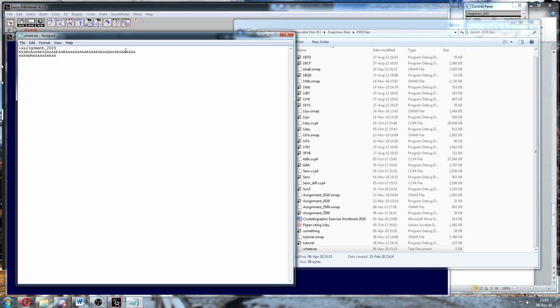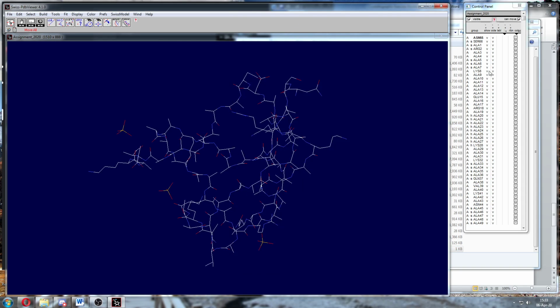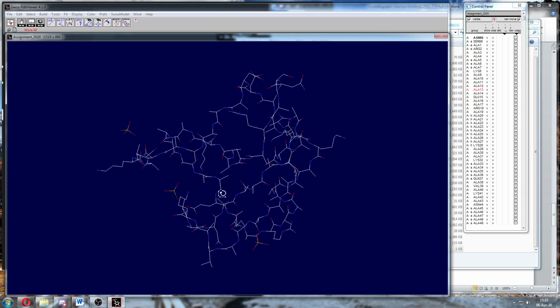There's a bunch of A's in here that are not A's. You need to fix those. If it's a non-A already, leave it alone, because it's correct. Like number 8 is lysine, and number 18 is arginine. But number 11, 12, 13, those that say alanine may or may not be. So go through and change those. And I'll work on some of these together with you. And if you want to watch the video again to learn how to do it, just go through and do that.